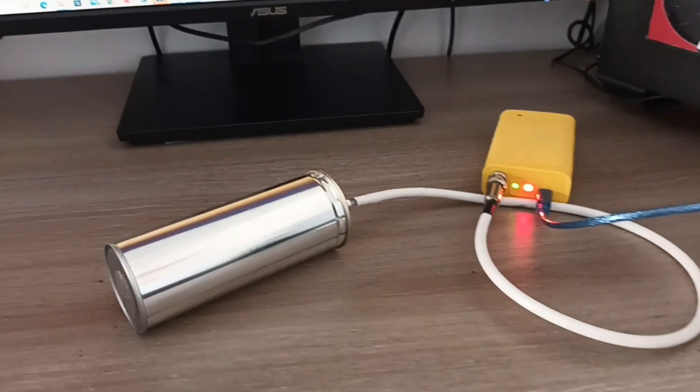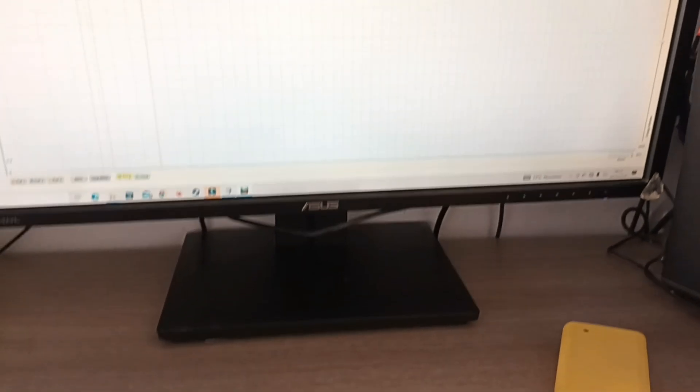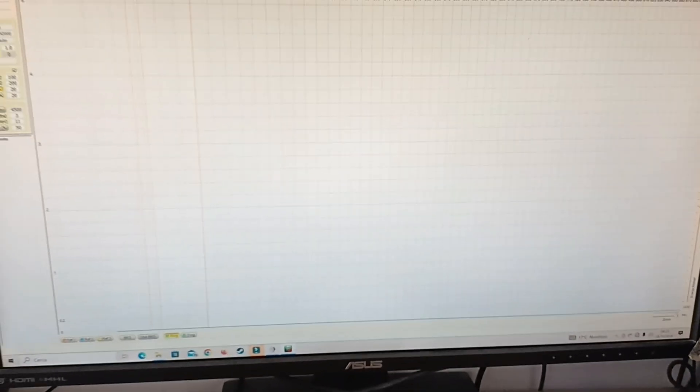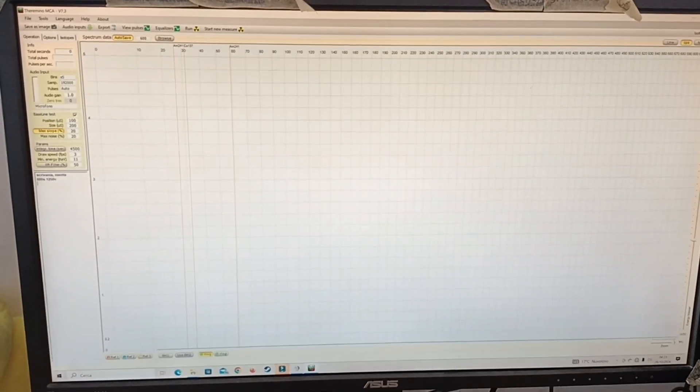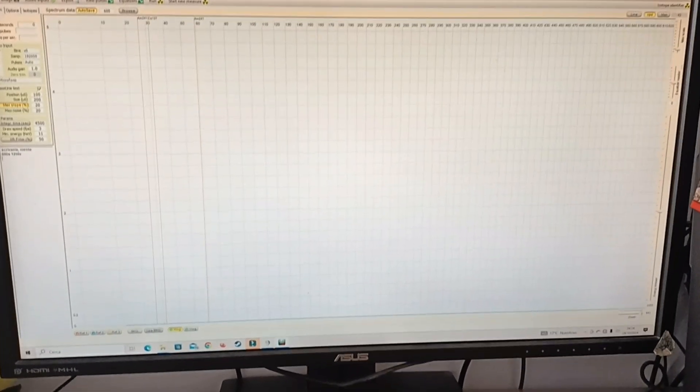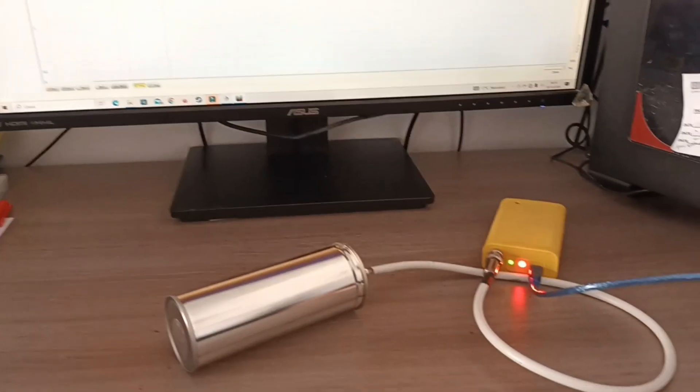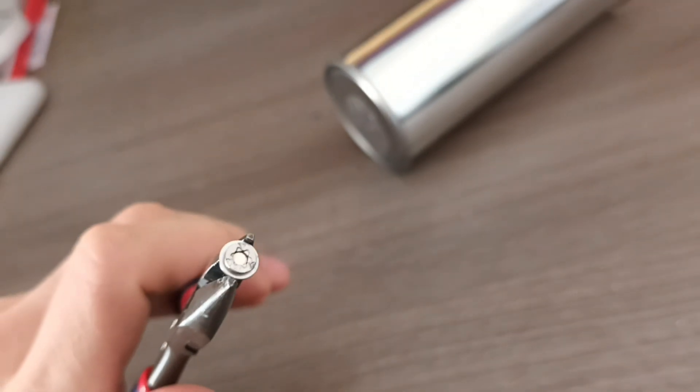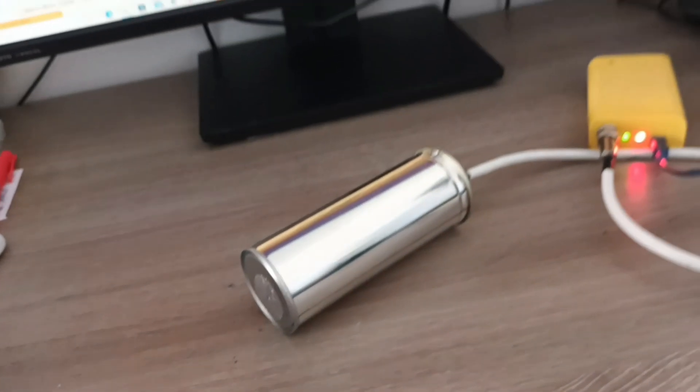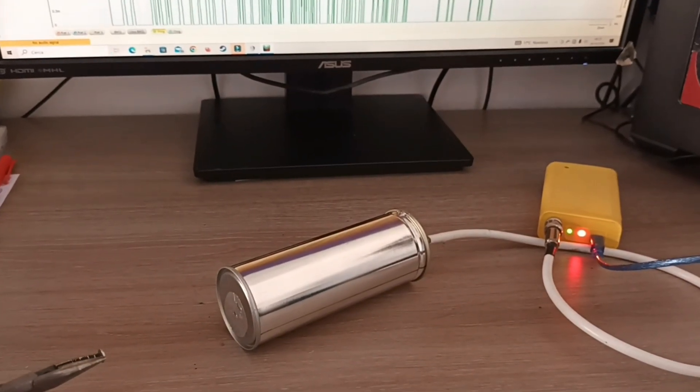So now that our probe is done we need one last thing to be able to use it. Well first of all a computer with the Theremino program running which is the multi-channel analyzer, but we need also a radioactive source to calibrate it and this time because we are interested in the low energy spectrum I'm gonna use this americium button which comes from a smoke detector.